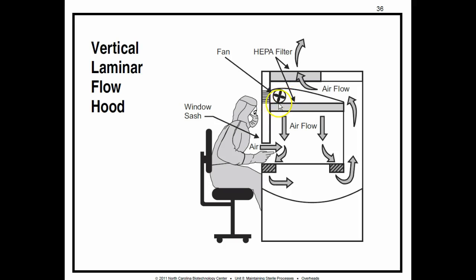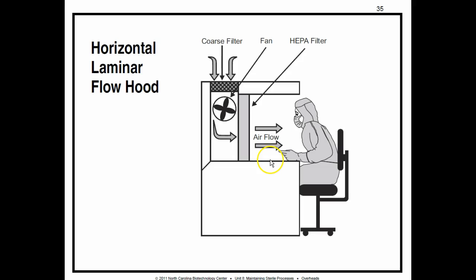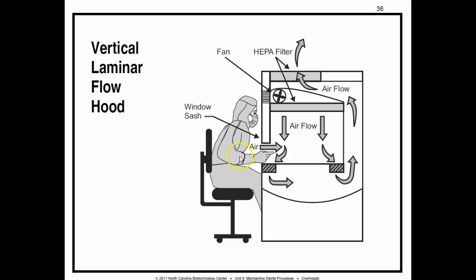Vertical laminar hoods are a little more complicated. Notice there is a sash in front — this is intended to protect the worker and not so much the material, though you still want to protect the material. HEPA filters are at the top, so air is filtered before it comes back down. It flows down vertically behind the sash and through filters, with air drawn in underneath the sash where the person is working. You need to know the big differences between both horizontal and vertical laminar hoods — it is very important for your test.